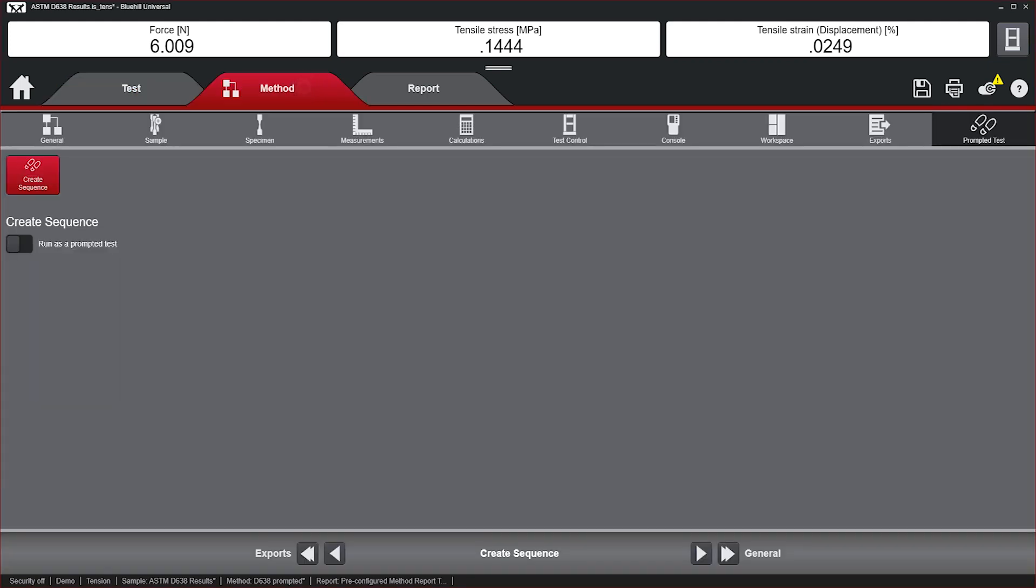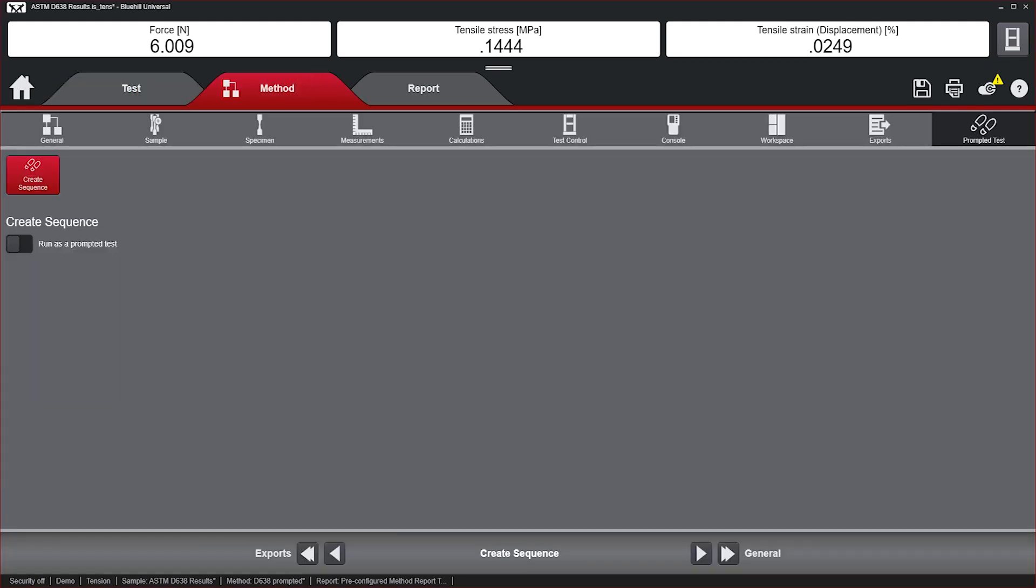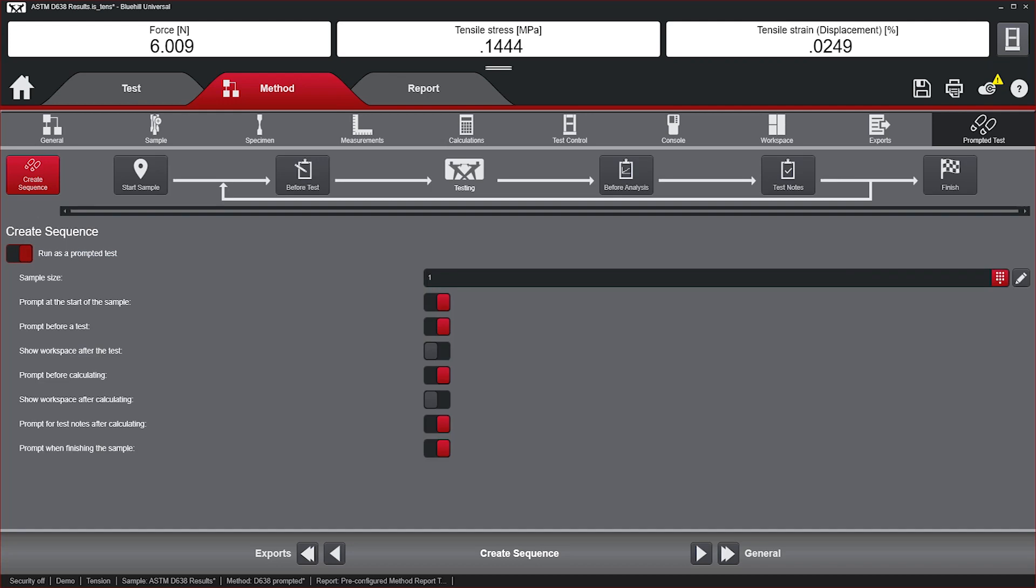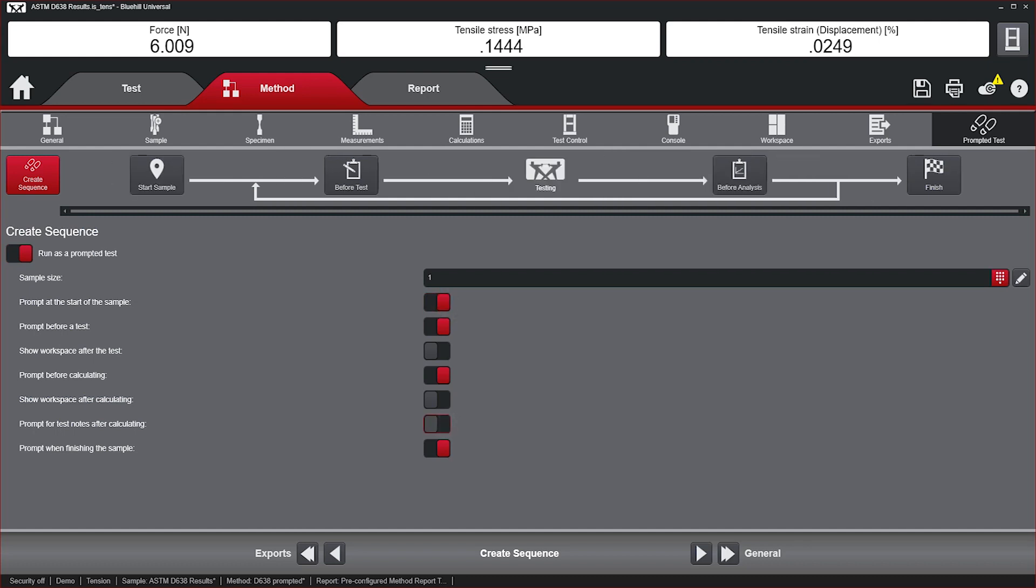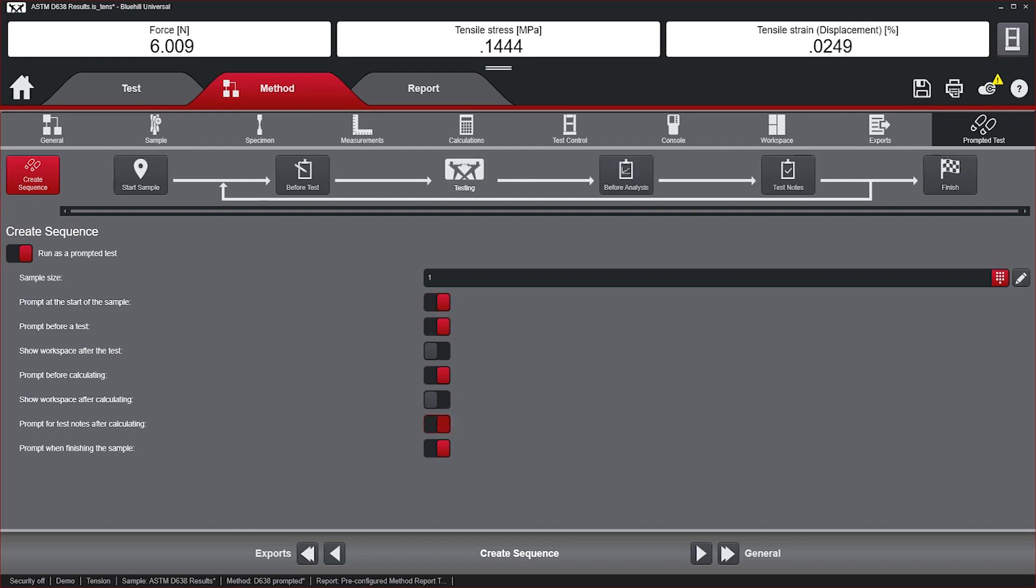A prompted test can be configured by going into the Method tab and turning on Prompted Test. By enabling Prompted Test, a user can create a workflow that the system operator must follow until finishing testing. Here is a list of some of the options that can be configured as part of Prompted Test.